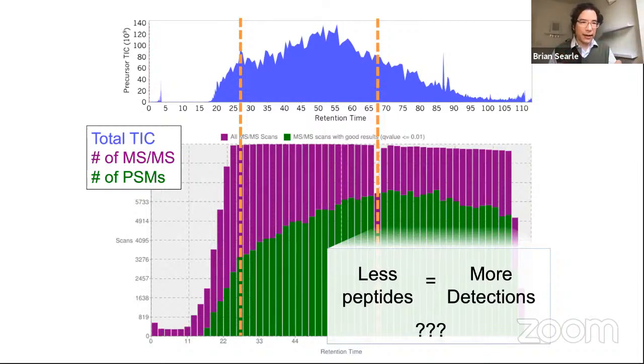But that said, the more you increase retention time, the more you have to spend time on that specific sample and not on other samples at the same time. So you can stretch it out further and further, but that still doesn't make it such that if two peptides have somewhat similar chemical properties, they won't still fall on top of each other, even if there is space between those peptides and other peptides. So you can make the problem a little simpler, but it still has an asymptotic potential.